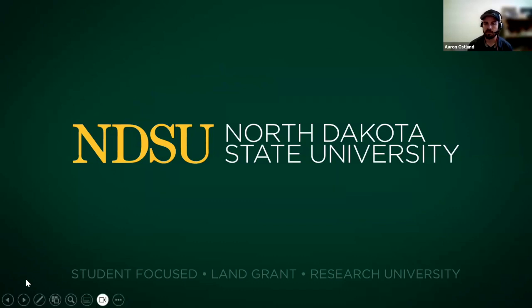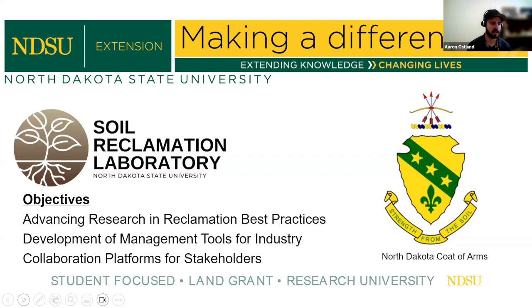Today we are going to be mostly focused on photoionization detection, and we have a guest speaker, Justin Blackman, who's going to share some insight into advancements in the technology and specific applications that might be pertinent to some of you practitioners in the field of remediation and reclamation. Before I hand it over to him, I'm going to go through just a little bit of background of what the Soil Reclamation Laboratory here at North Dakota State University is up to and how we have gotten to the point of jumping into a webinar and workshop series around photoionization detection.